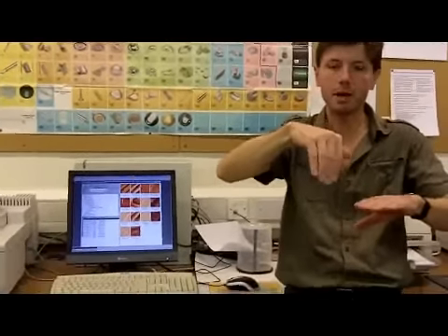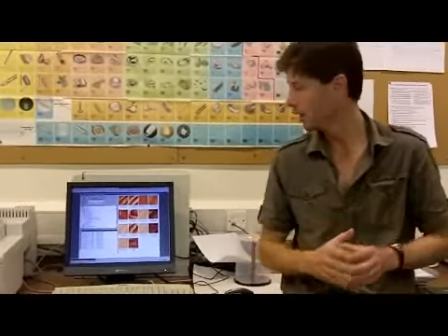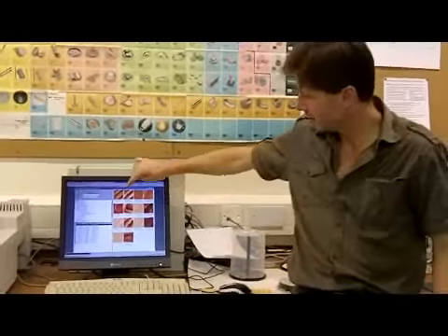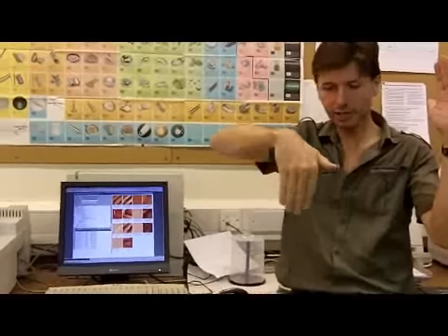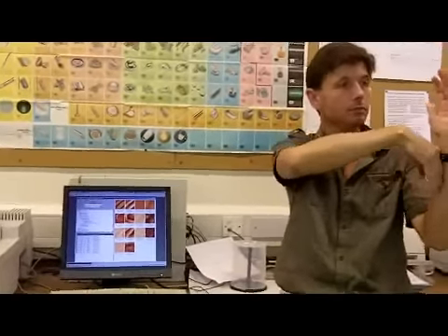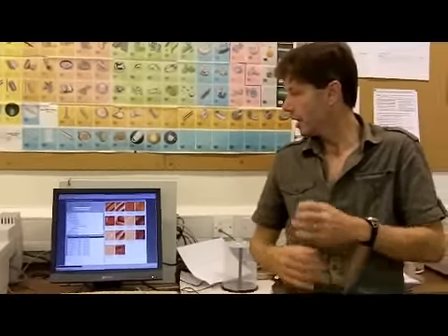Now that's a really good mode for getting atomic resolution. It's very useful if you're in a very small, flat area and you want to look at individual atoms. And it's called constant height. The problem with it is that as you scan over the surface, you can see here, we've got these dark lines. These are step edges, and they're often multiple copper layers. So your tip is scanning along on a nice flat surface, and it suddenly runs into a brick wall. And what will happen is you will knock the end of the tip off and destroy your imaging. Quite often, you then have to replace your tip. So it's good for looking at atoms, but it's not very good for looking at larger areas.